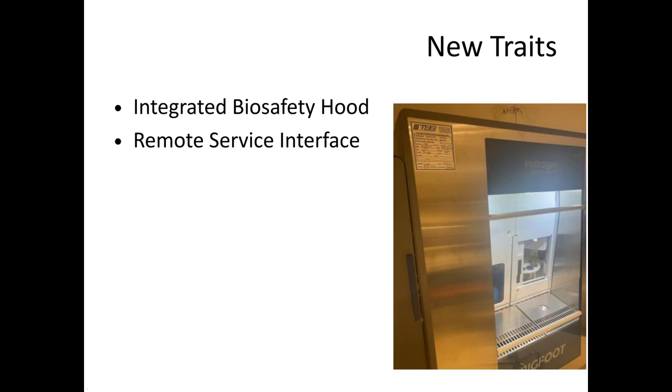We were at the time a couple of years into what I call the hood fetish, where every single sorter had to be jammed into a hood. Sorters didn't like being in hoods. The hoods were ridiculously huge and expensive, and it just didn't make a whole ton of sense. Yeah, I can't argue that it nominally increased the safety of doing this, but I feel like good PPE practice and all those things before, it was never really that big an issue. And then to suddenly be decreed, oh, every sorter now needs to be in a hood if anything's even remotely BSL more than one.